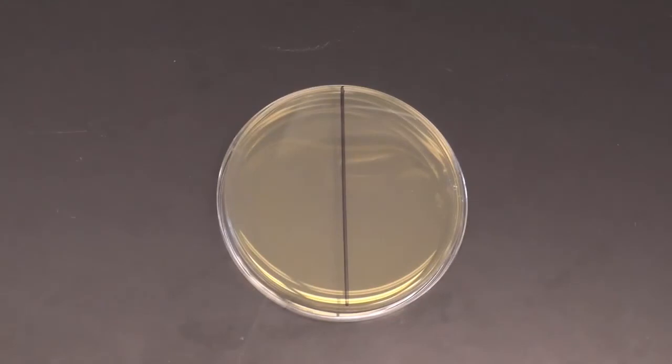Label an agar plate and draw a line down the middle of your plate at the bottom to divide the space in half. This allows you to plate two replicates of the same sample on the same plate.